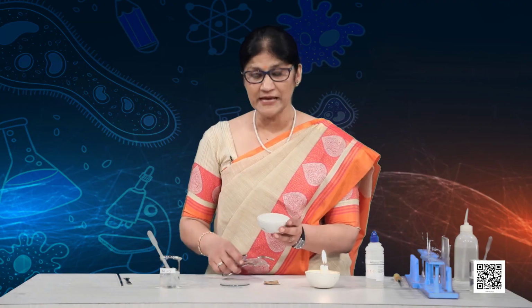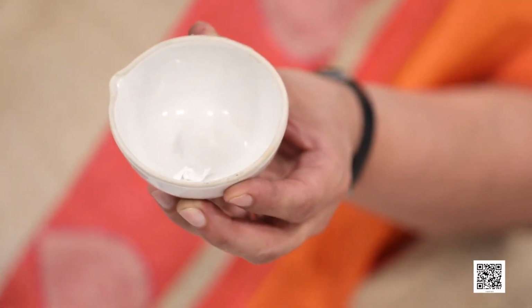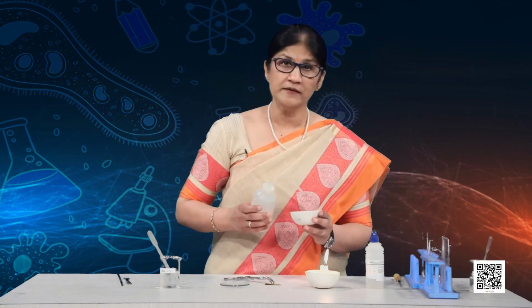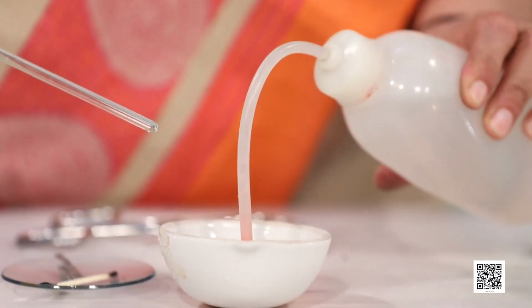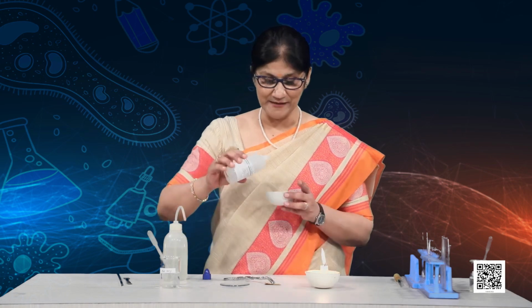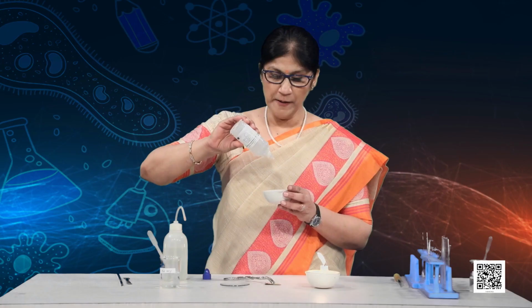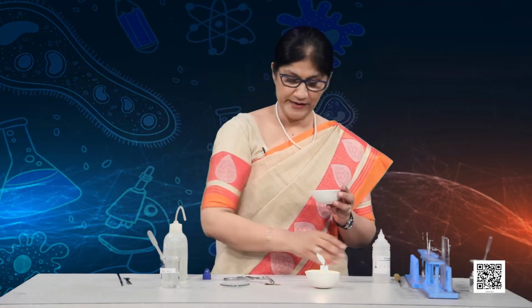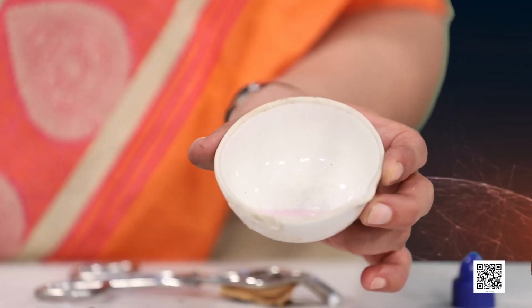We have collected this in the china dish, and now to this I will add some water to make a solution. Okay. So, we add some water here, and to this I add a drop of phenolphthalein. By now we all know that phenolphthalein is a basic indicator, and it gives me a pink coloration when it reacts with bases. So, see what a beautiful pink color we have got.